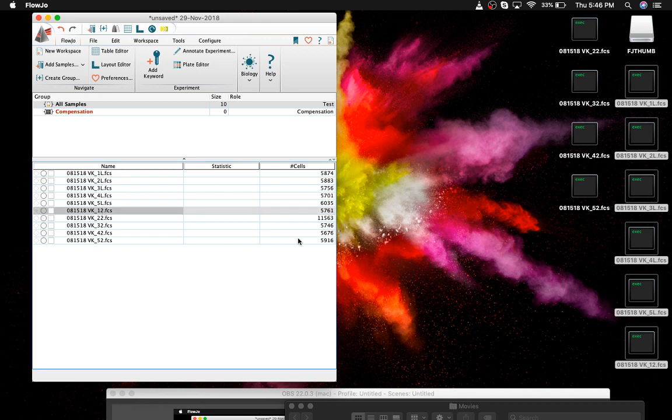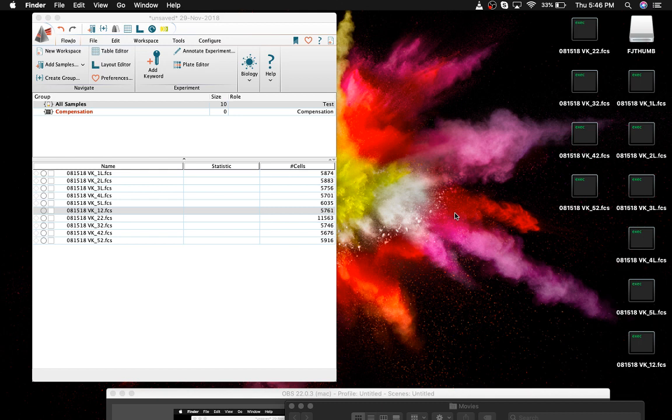And for example, in the 12, I would just add the secondary, and that should probably not give any signal at all because there is no primary. So before you edit, you have to make sure that you use your secondary as a control, so that you can negate all the unspecific binding.